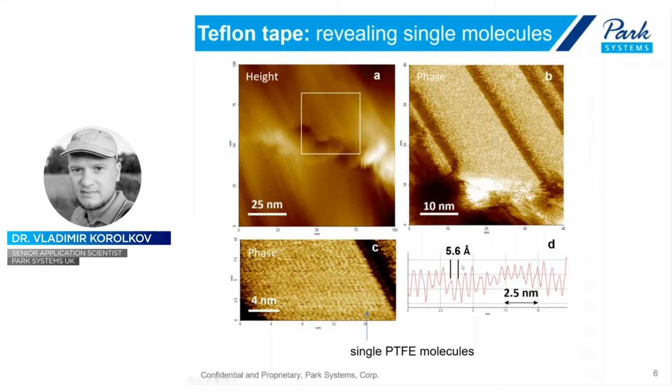If you remember, I showed you diffraction data on slide 3, and that data showed a very good agreement. So it's exactly the same number we acquired on the real piece of polymer in the ambient with the atomic force microscope.